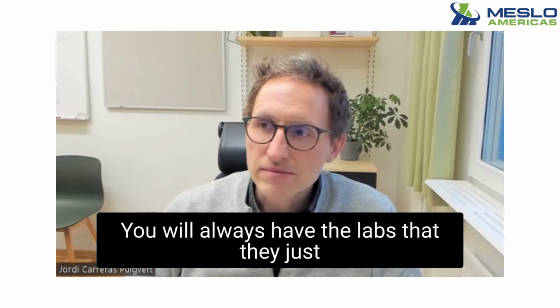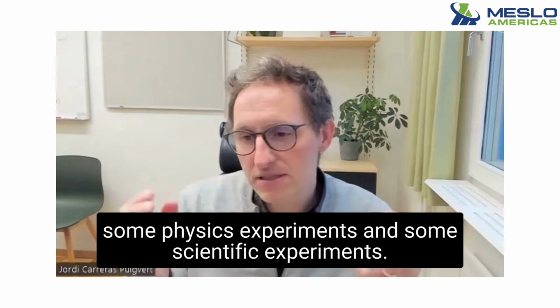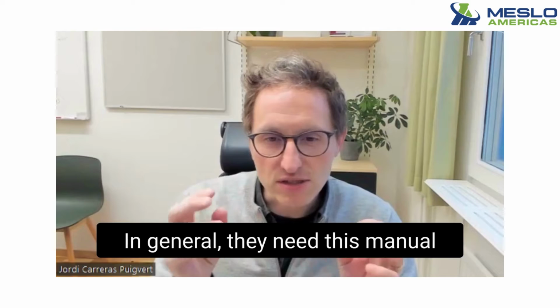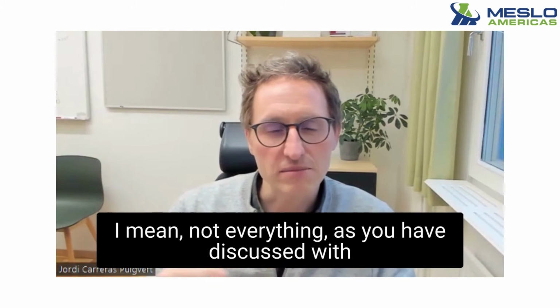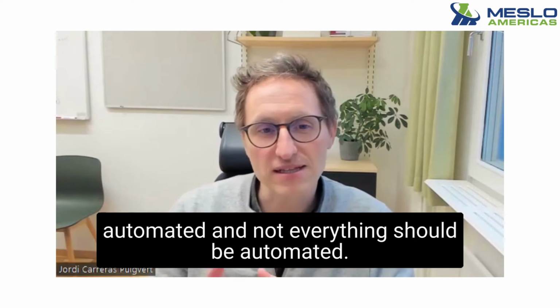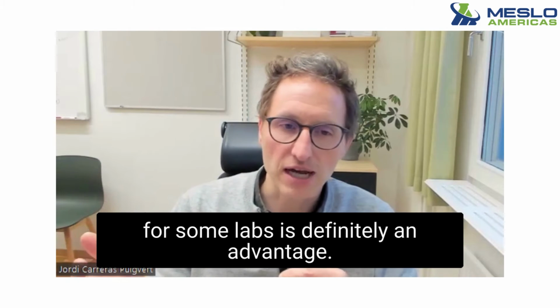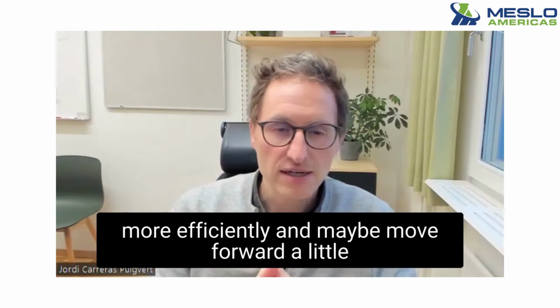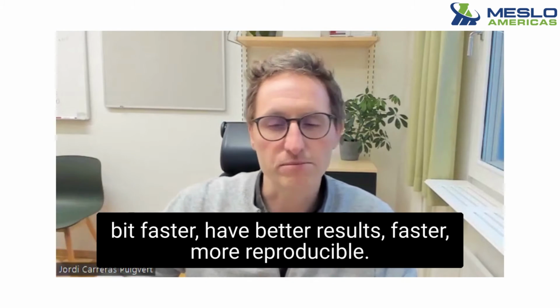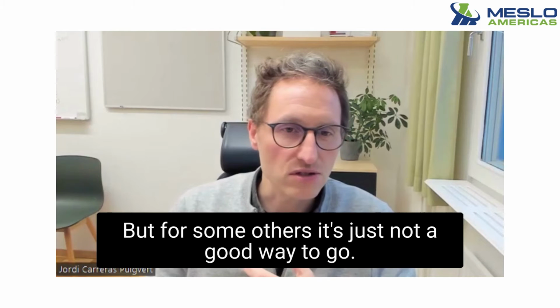Yeah, I don't know. You will always have labs that just need to do manual experiments. Some biological experiments and some physics experiments and some scientific experiments in general need this manual touch, and they cannot be automated. Not everything, as you have discussed with other guests and so on. Not everything can be automated, and not everything should be automated. But I do think that incorporation of automation for some labs is definitely an advantage. It can allow you to do more experiments more efficiently, maybe move forward a little bit faster, have better results faster, more reproducible. But for some others, it's just not a good way to go.